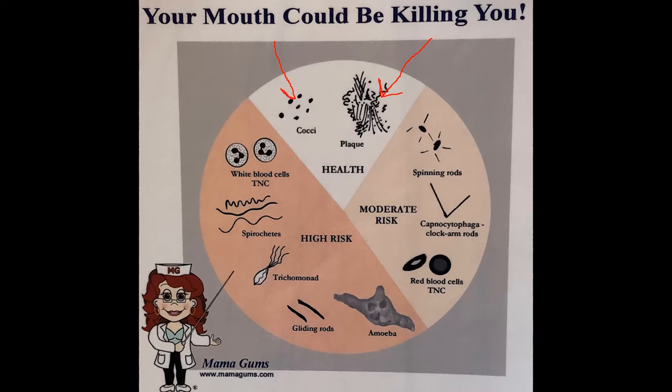We'll often see a lot of dot-shaped cocci bacteria. Typically, there's going to be some white blood cells that are round, and you can see the little granules moving around inside of the cells, which is kind of neat.